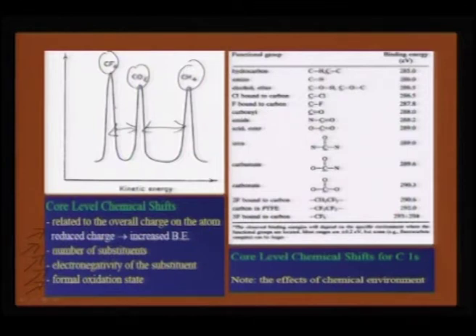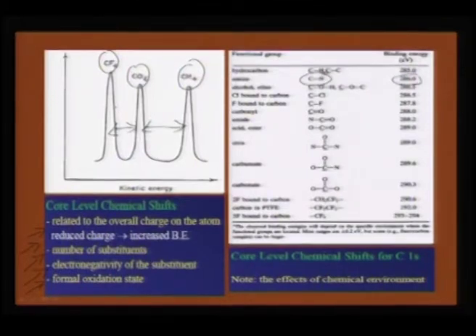In fact, for many organic compounds or materials with organic substitutions, just like IR gives a fingerprint region, so is the case for these functional groups. In the case of a carbon-nitrogen single bond, you can see 286.